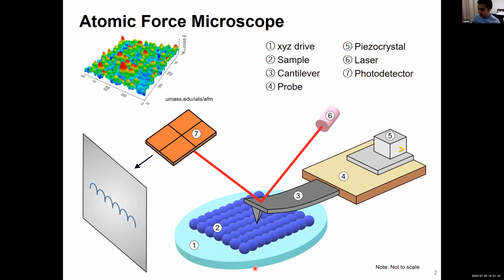And the setup is composed first by a drive, which is from here, and basically it holds the samples. And then by a system of strain gauges, it helps us to move the sample in the X, Y, and Z direction. And then we have here the beam, which has a tip at the end. And depending on the mode that you are working with, you can get the surface topography based on the deflection of the beam and also on the vibration of it. Then the beam is connected to this probe, which constrains the vertical displacement.